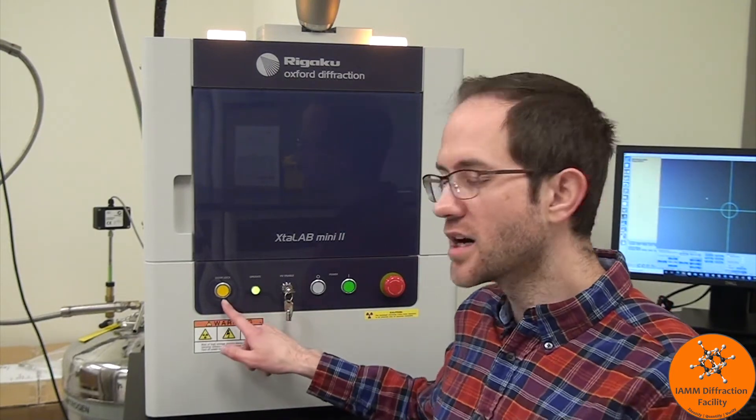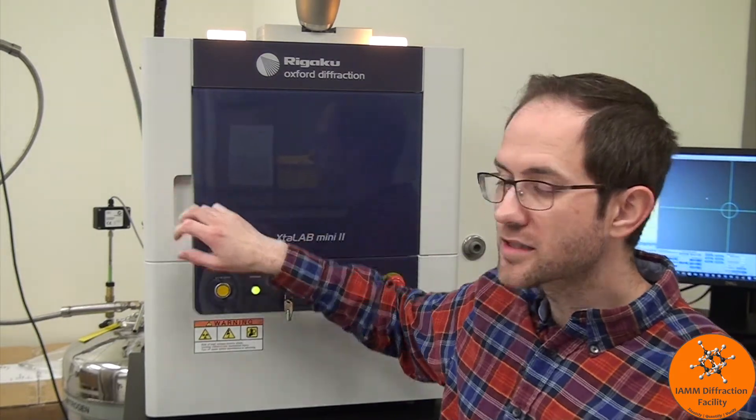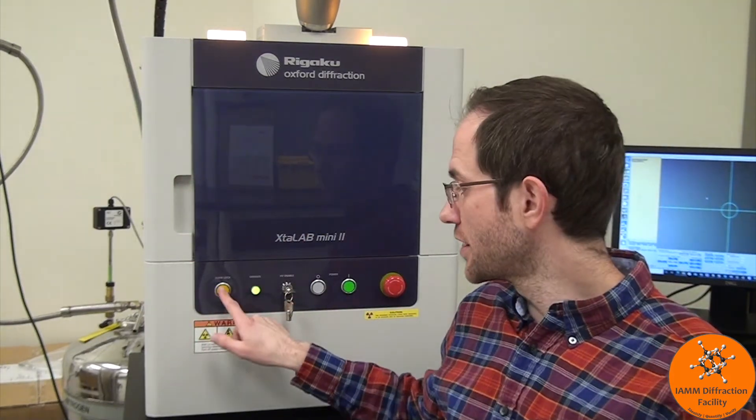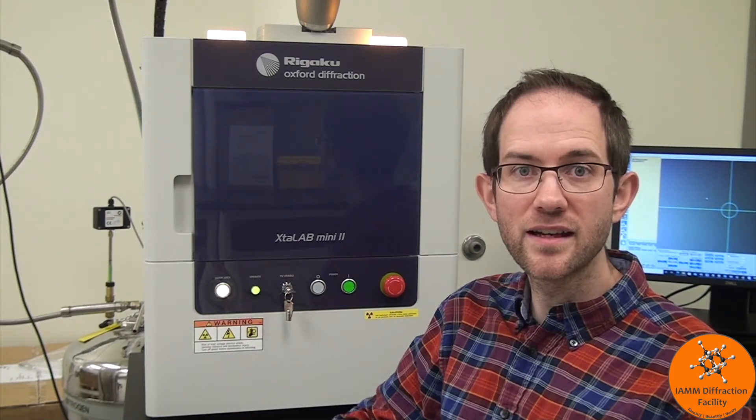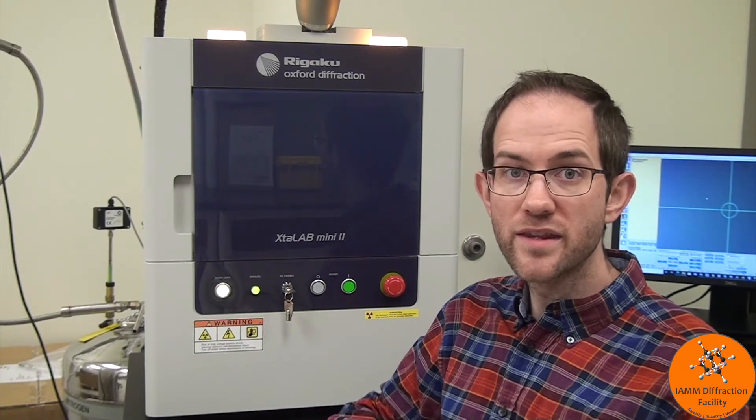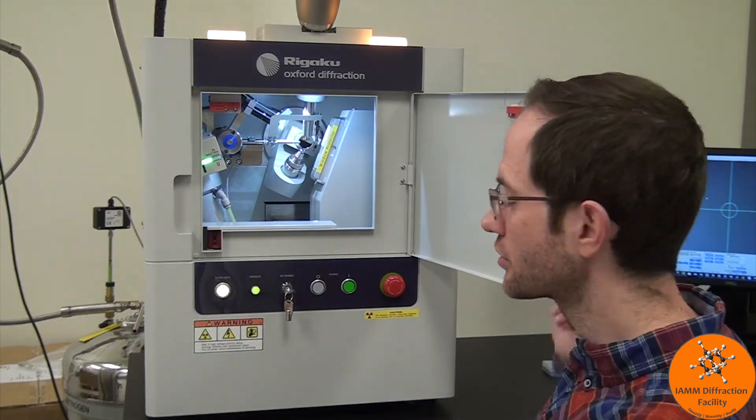Before we begin though, let me point out this door lock button. When it is off, that means that the door is locked, but as soon as I press the button, it turns solid yellow and then it begins blinking and making a beeping sound. When that happens, I am able to open up the door and now we can take a look inside at some of the hardware.